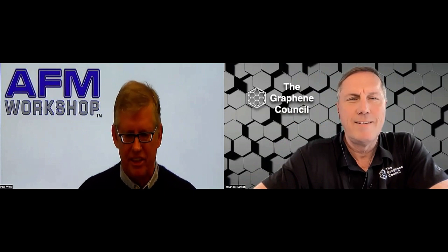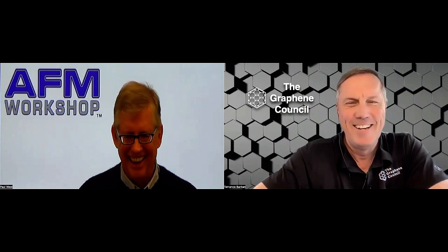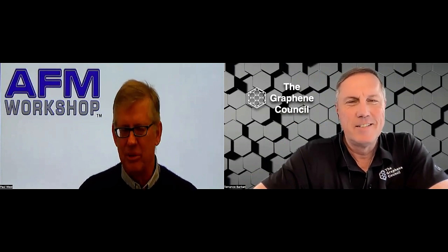And I start out by saying, what do you use an AFM for? And the answer is, use an AFM when nothing else works. Just start with that. And so the question is, if it's the only thing out there that's going to actually make this measurement, then figuring out how to make it work in your environment and get the right number of samples.